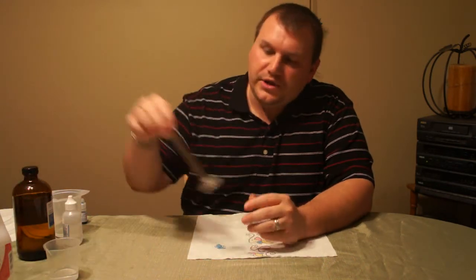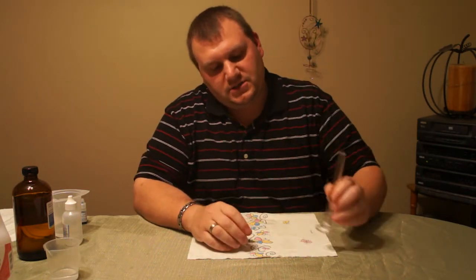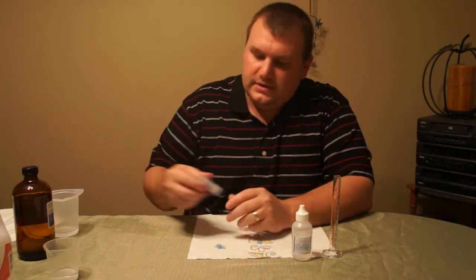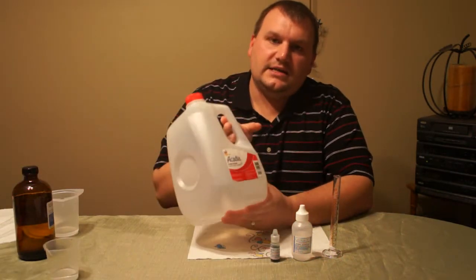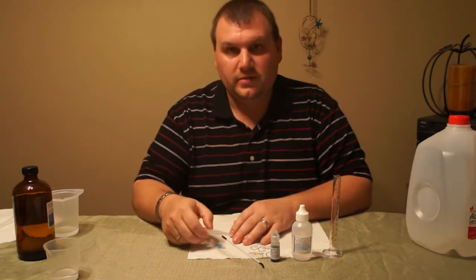What you need is a 10 ml graduated cylinder with 0.1 graduations on it. You need 0.12 N sulfuric acid, some bromothymol blue, some distilled water, and it also helps if you have a mixing rod and one or more pipettes.